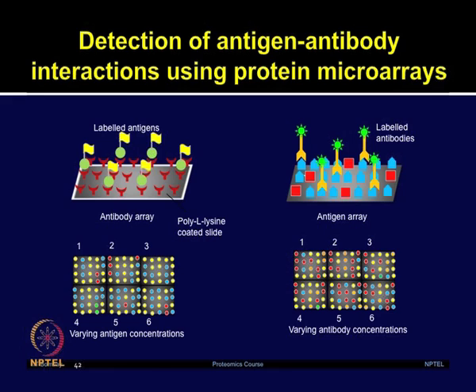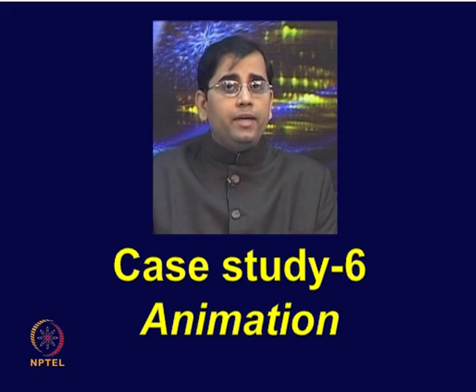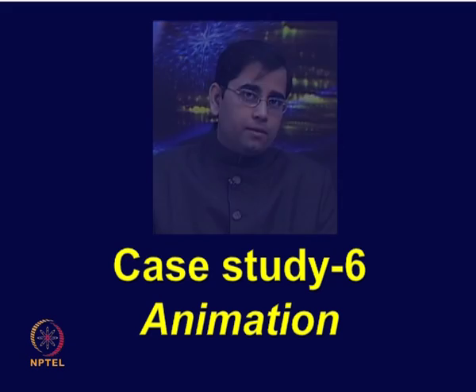The protein microarrays can provide a practical means to characterize patterns of variation, as you can see in these slides, and then hundreds of thousands of different proteins can be probed on this type of platform. Let me show you details of this study in the following case study in this animation.